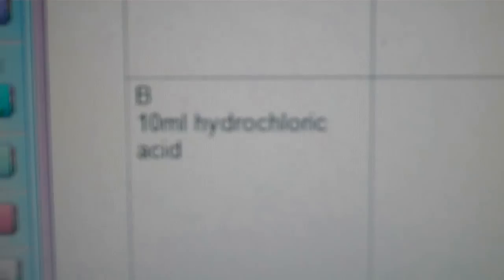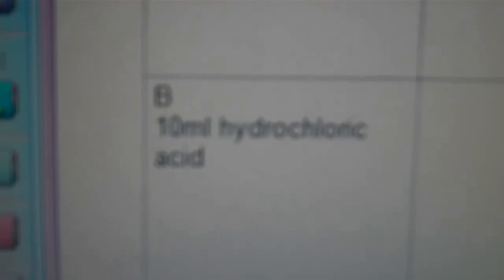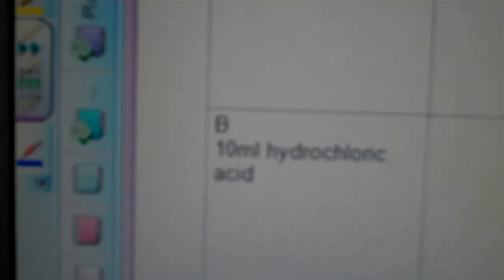In test tube B, we're going to put acid, this is hydrochloric acid that's normally found in the stomach. And in test tube C, so test tube B will also have three pieces of egg white.